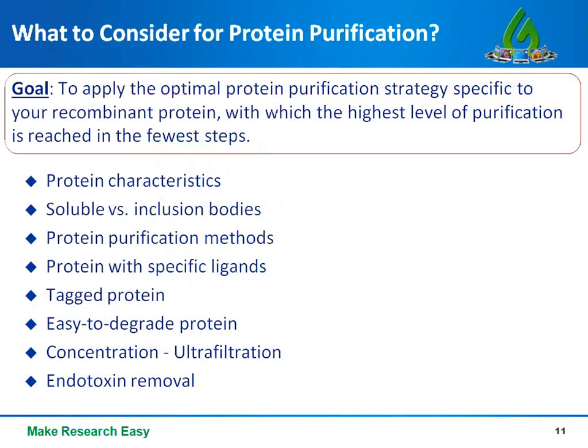What if the protein concentration is too low? How to remove endotoxin in the sample so that the protein can be used for some in vivo studies? With all those questions in mind, let's go through each parameter one by one with some case studies.